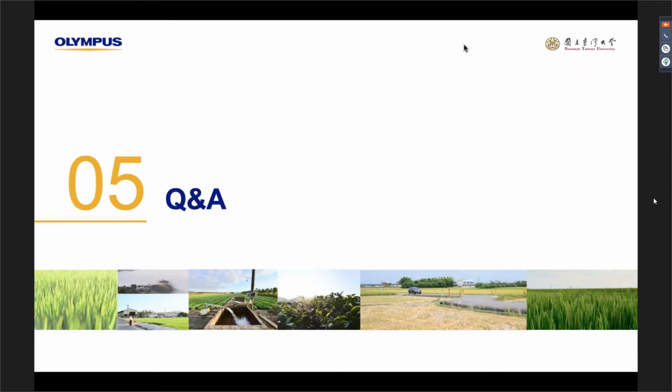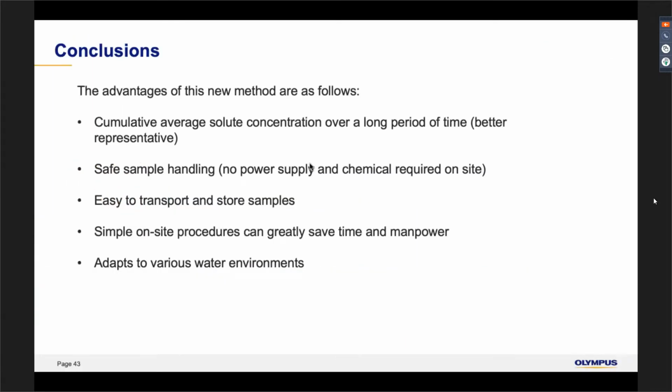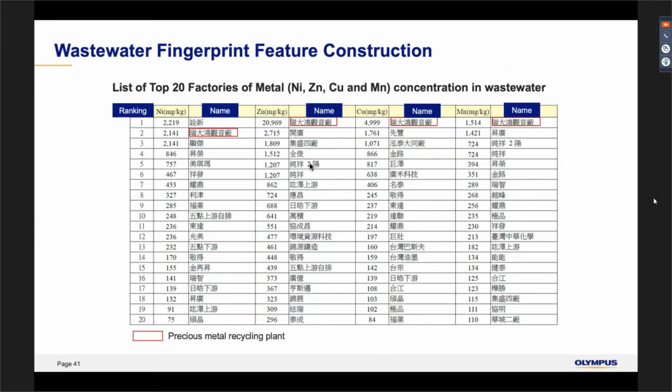教授，他们是说有没有工厂会不会伪造数据？ That's for sure. They will do that. So Prof. Chang was saying that it is common that factories will manipulate data. They will change the data. But this is where, if we are using the resin, like what Prof. Chang shared in the previous slide, let me go back to this one to share with you guys.